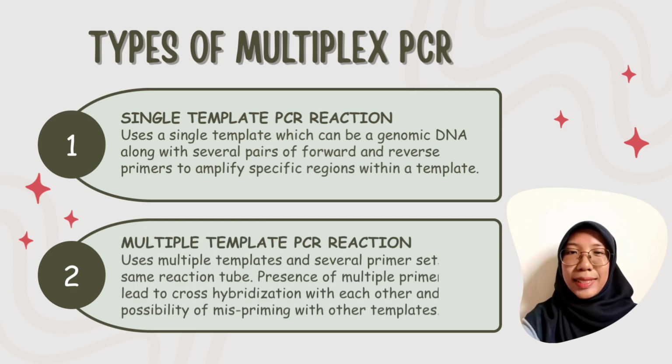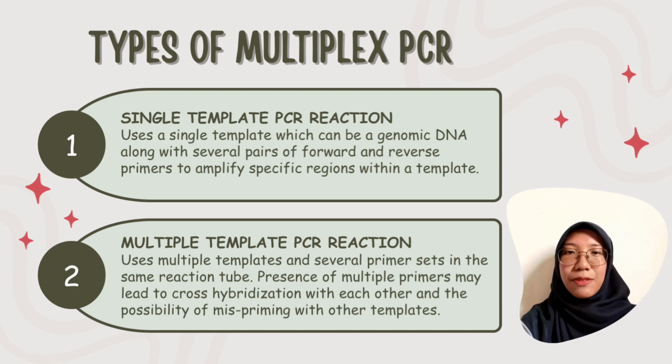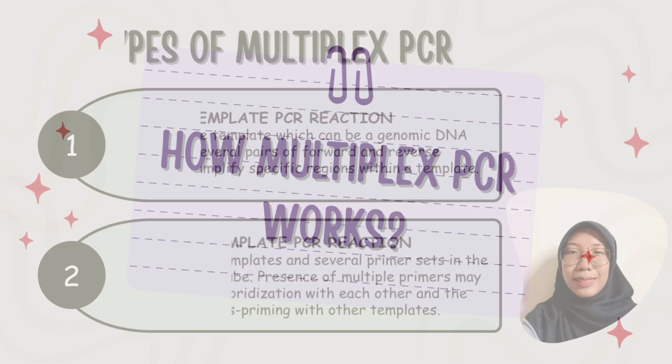The second one is multiple template PCR reaction. This reaction uses multiple templates and several primer sets in the same reaction tube. Presence of multiple primers may lead to cross-hybridization with each other and the possibility of mispriming with other templates.